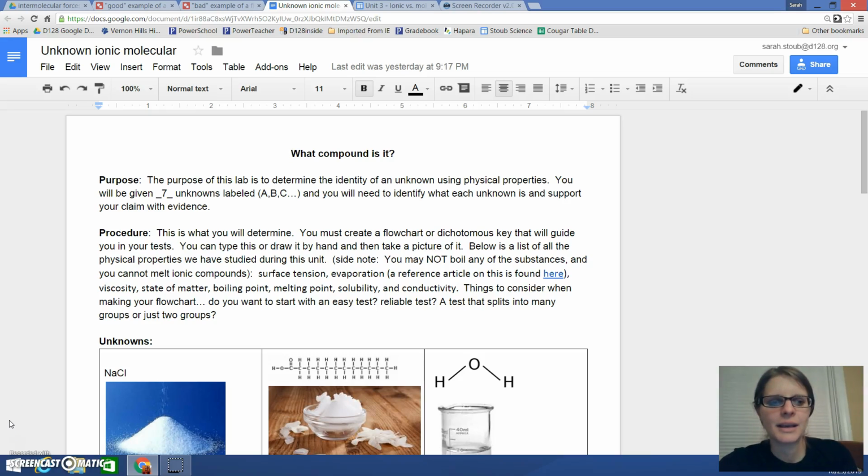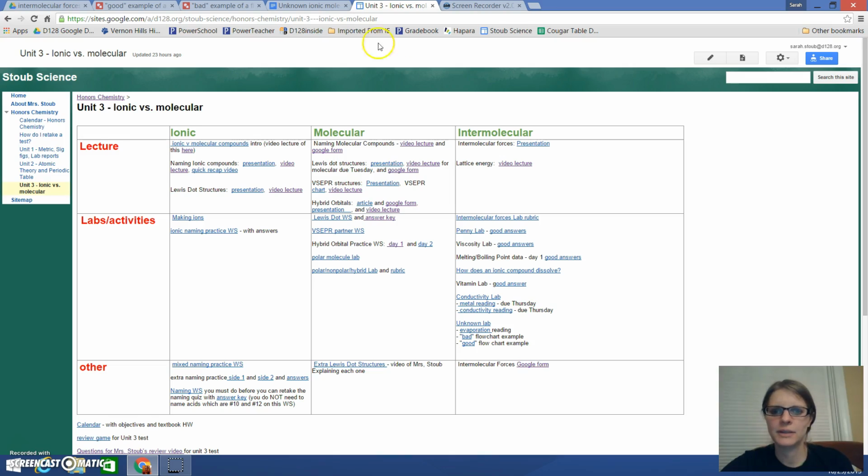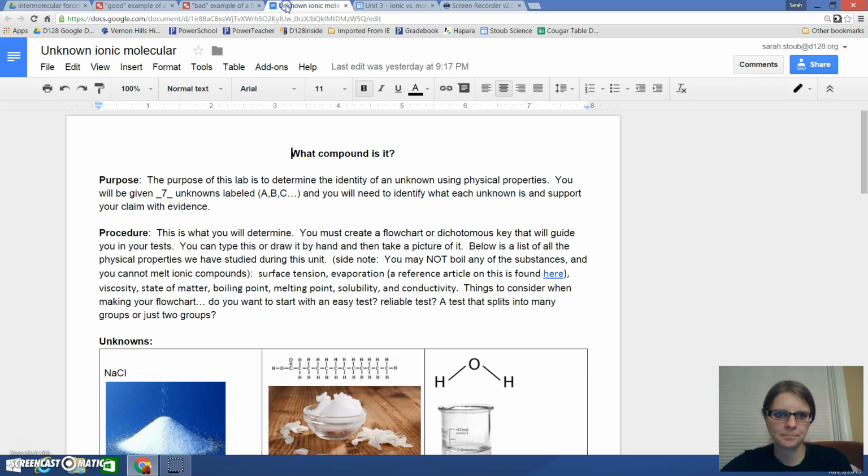Hello! This video is about the unknown compound lab that you're going to be talking about. I would first start by going to my website, which you can see here, and opening up the unknown lab, which is in the bottom rightish of your intermolecular column. Below there you'll see an evaporation reading, which might come in handy, and the good and the bad flowchart, which I'm going to be talking about too and showing you in this video. But let's go to that unknown lab.